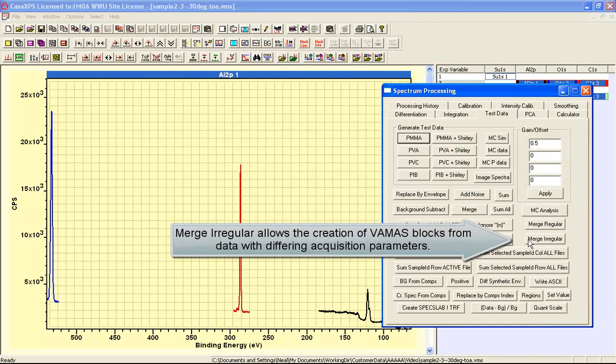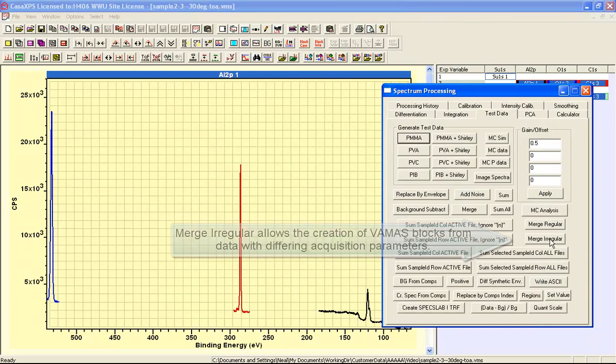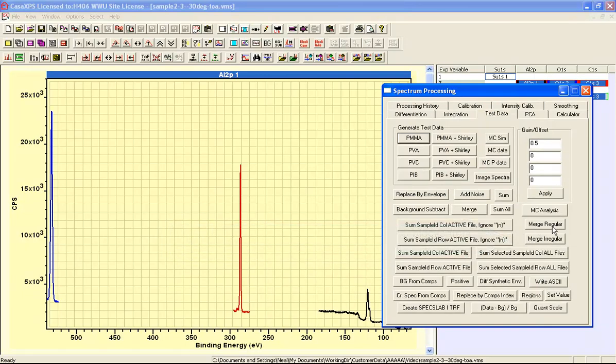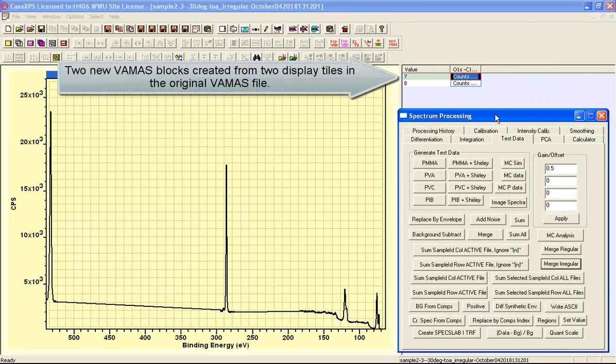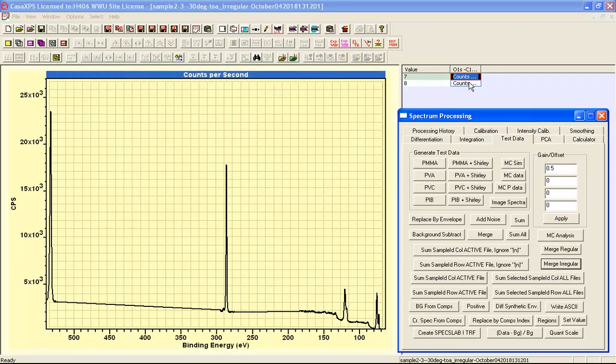That is to say we want to use this button here that says Merge Irregular rather than the Merge Regular. The Merge Regular requires a uniform step size for all spectra. But if we use Merge Irregular, then a pair of VAMAS blocks are created from each display tile in the previous file with spectra overlaid in the tiles.